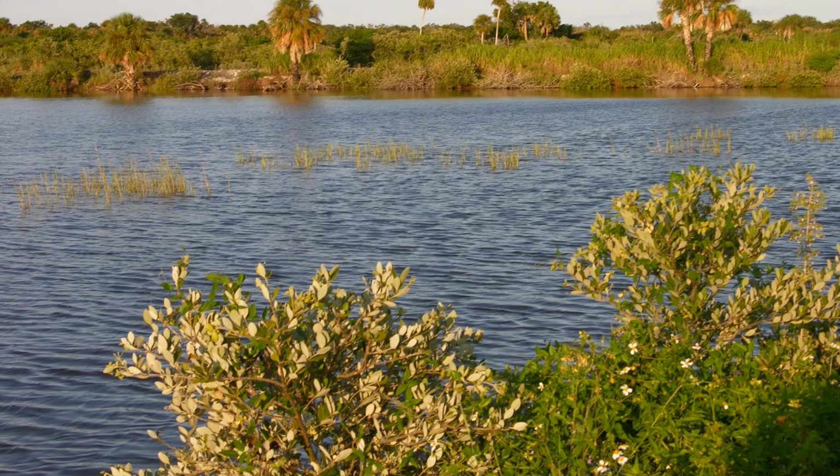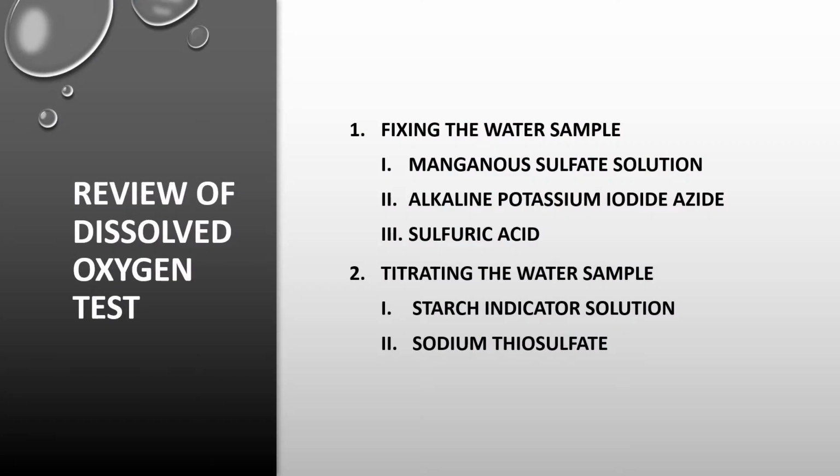This image shows a healthier lagoon than the one shown at the beginning of this video. The general process for testing dissolved oxygen included fixing the water sample and titrating the water sample.